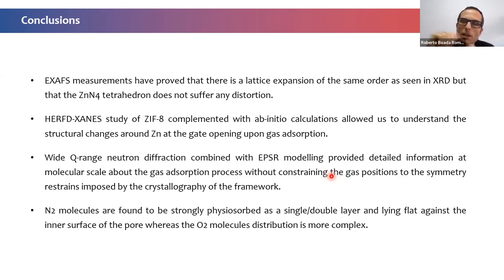the group that is in the methyl group. So in this case it's the methyl group, but if we change this group, it can change the interaction with the gas, and then this gate opening will happen in a different way. Not only the change of the gas molecule, but also the change on the organic ligand changes this gate opening transition that has been reported by Coder and others.